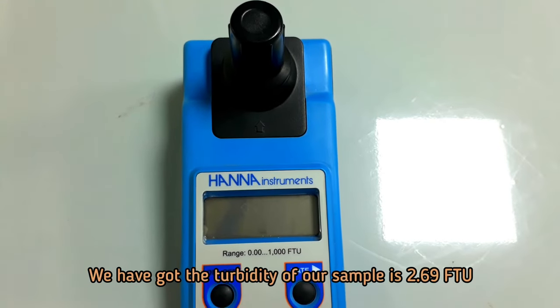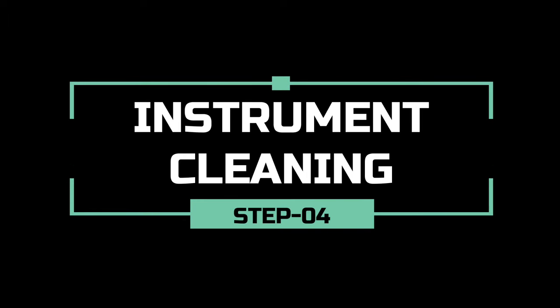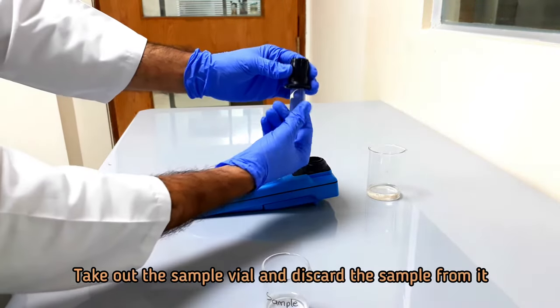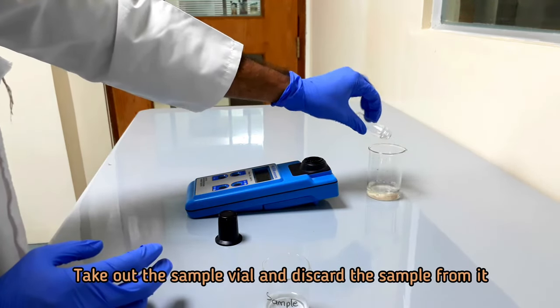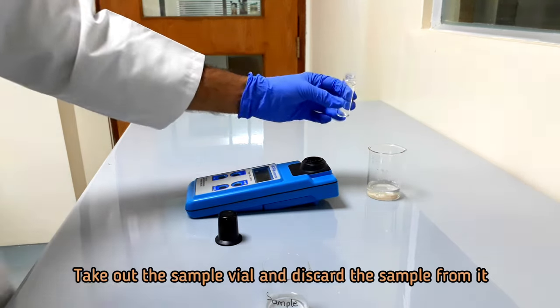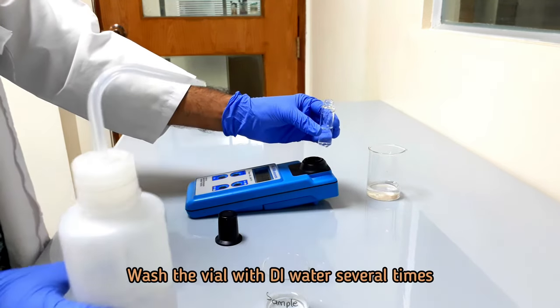We have got the turbidity of our sample is 2.69 FTU. Take out the sample vial and discard the sample from it. Wash the vial with deionized water several times.